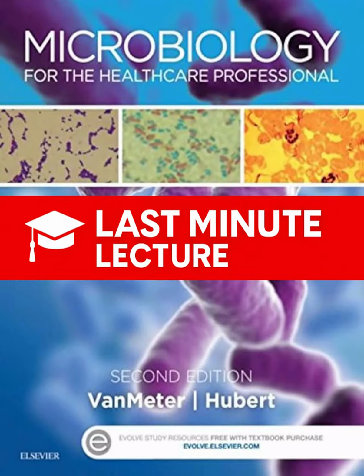Okay, so if the lab is this critical, high-stakes place, how do scientists organize their approach? There's a framework, right? The 5 I's. That's it, the 5 I's. It's a neat way to think about the workflow. Inoculation, incubation, isolation, inspection, and identification. We'll walk through those. But first, before we even think about growing anything, we have to talk about the absolute non-negotiable aseptic technique. The cornerstone.